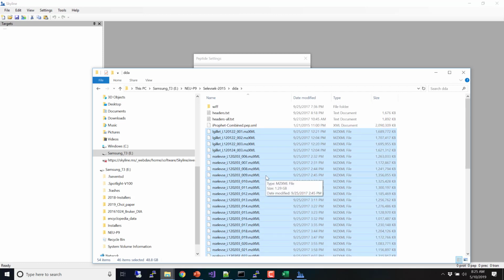And then there's fractionation, and because it's an osmotic shock experiment, they've actually done searches on samples from all the various time points in their osmotic shock. So somebody was just asking about pooling samples. You can also run DDA if you have an experiment in mind, say healthy and diseased.